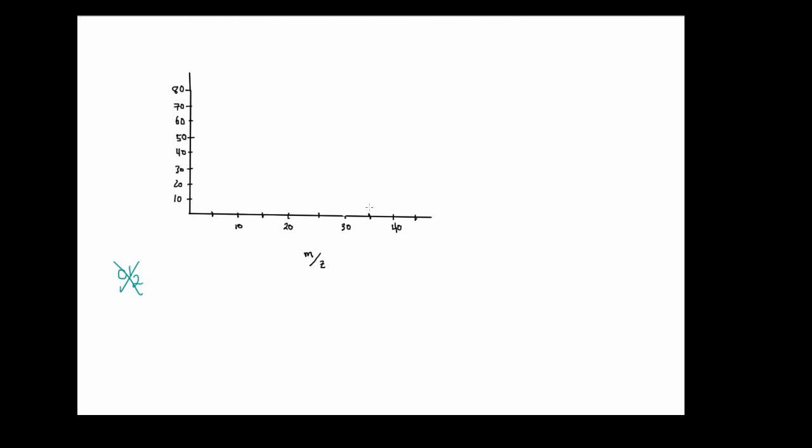All right, what we're going to have for this, remember that we're looking at two different isotopes here. One of them is going to be Cl35 and the other one's going to be Cl37. So we're going to have a peak at 35, and the 35 peak rises to about 80 here. And what is the vertical axis?